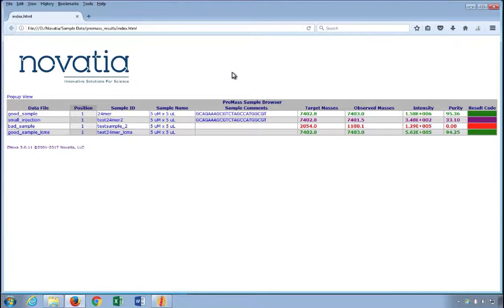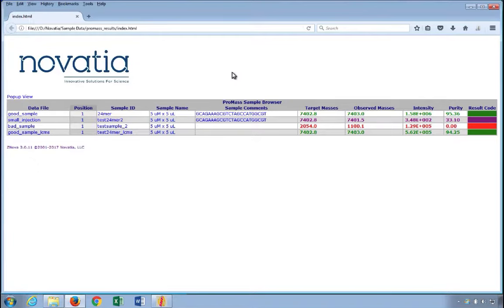You can see the sample ID, the target and observed masses, the intensity, the purity, and some other informational tidbits if you chose to include them. You'll also see a color-coded result on the far right, which we'll discuss in more detail later.